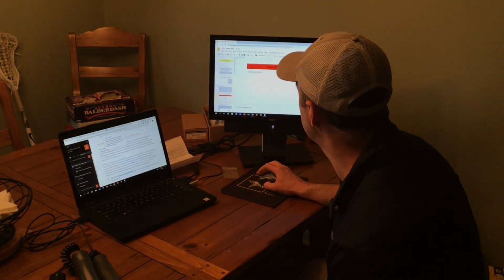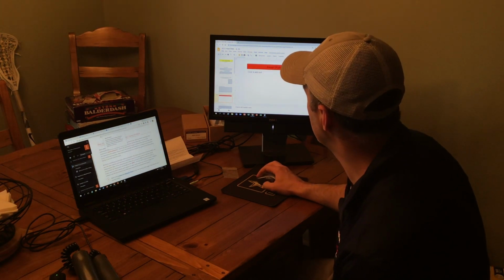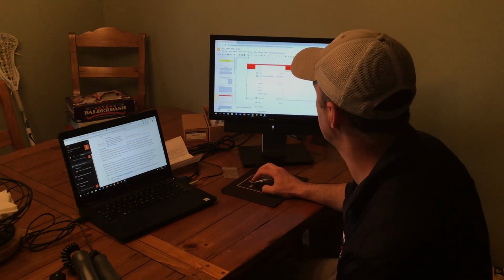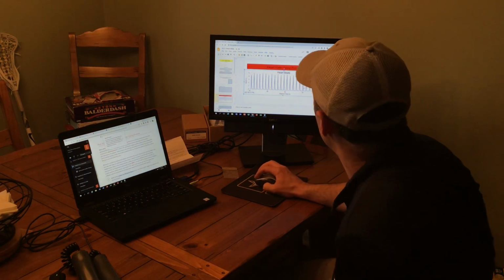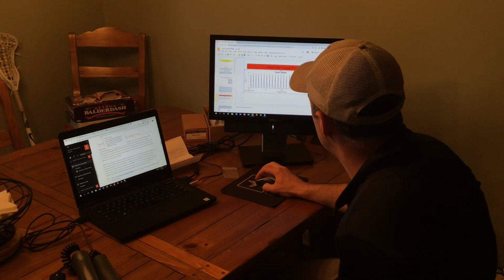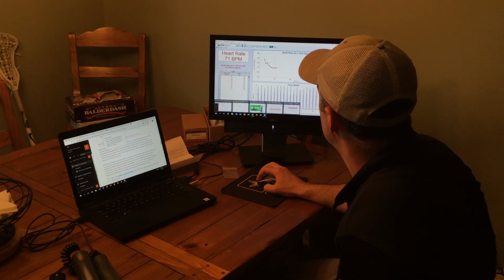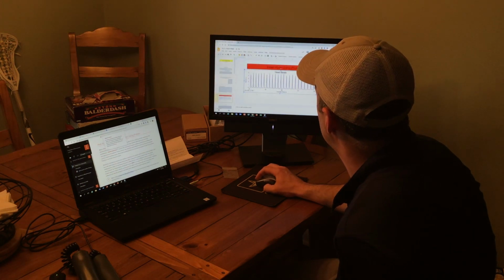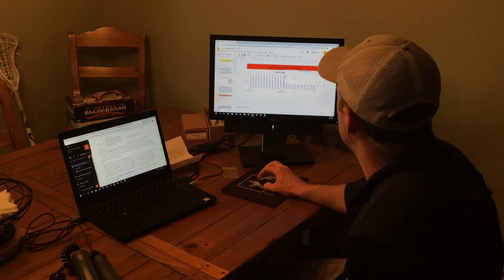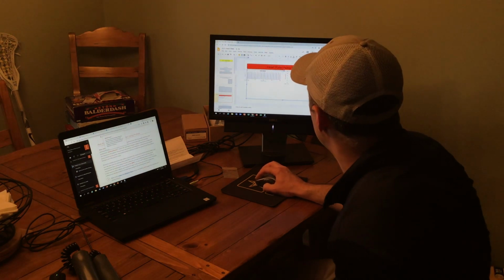And basically, heart rate using probes. Here it is right here. All you would do here is put that data that I copied. So now I'm going to paste it. All right, there's my heartbeats. I'll reshape it a little bit. Go back to Logger Pro, take this one, copy it, and put it right on here as well. It's probably going to paste right over the top of it. That's okay, and make it as small as I want. And I would have it on there.